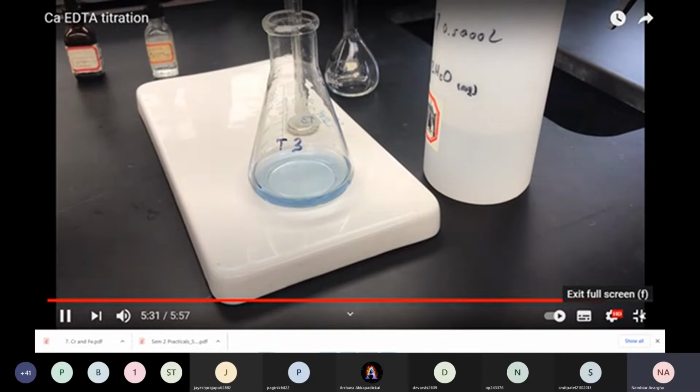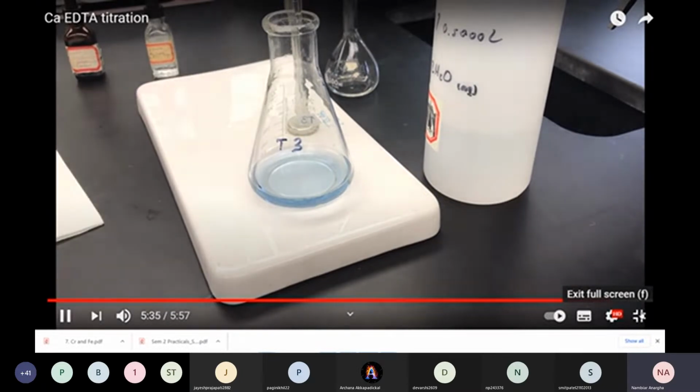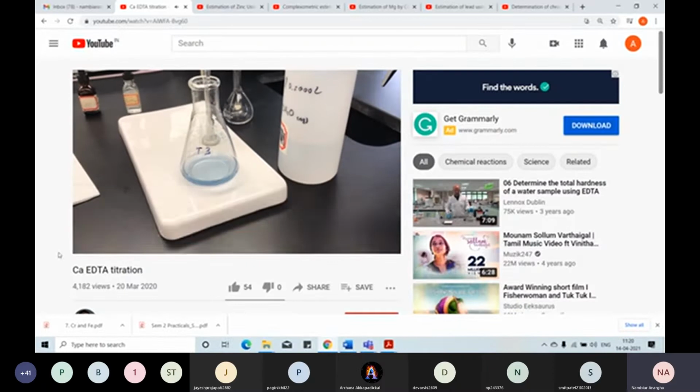And it looks like I'm at 60.20 exactly. So I've recorded that value. So at this point, this is what the titration is going to look like. So I'm going to end up feeding you data for all 4 of the titrations that I did so that we can then work them up. So that's something to do for another class period.